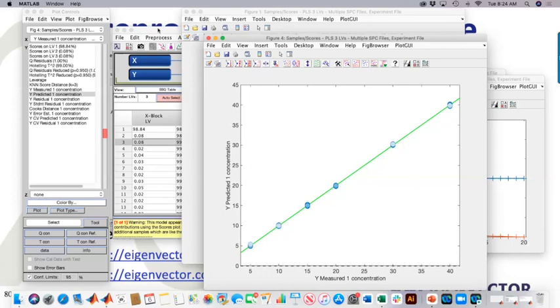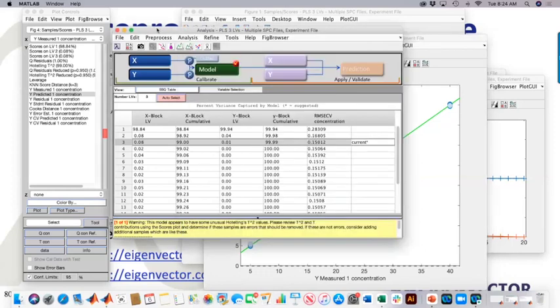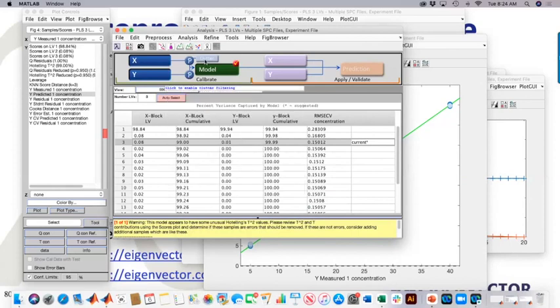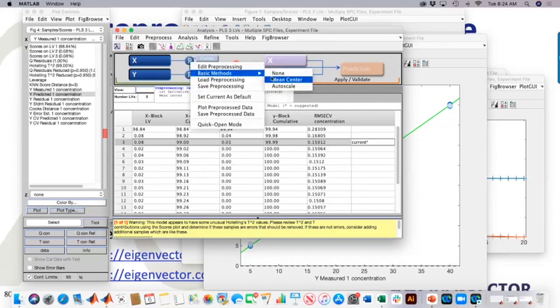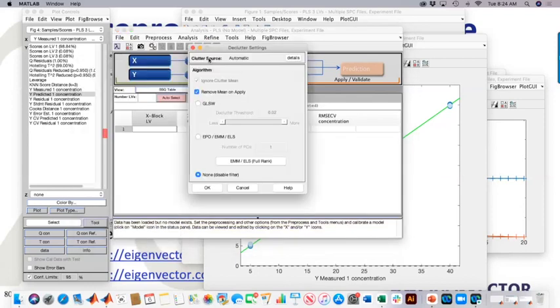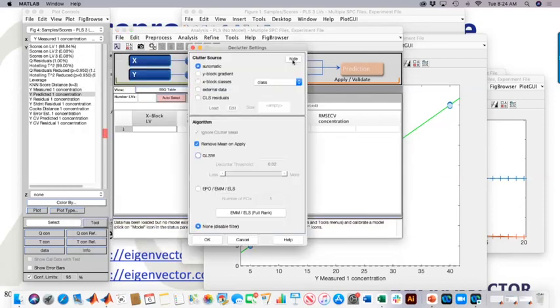Another thing that you could do is enable the clutter filter here. So I'm actually going to just move us back to mean centering, but then also open up the clutter, and I could use those classes that I set up in my data set and make a filter on them. Now, why could I do that? Well, think about this.